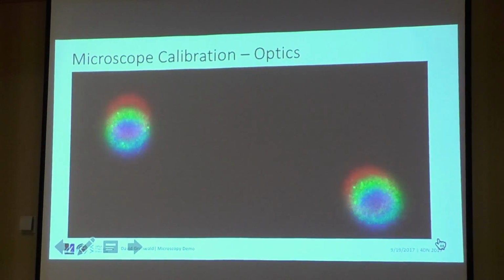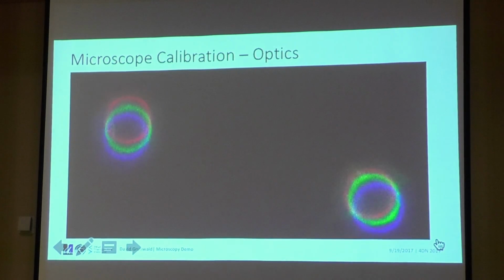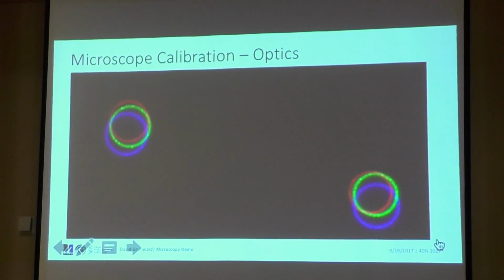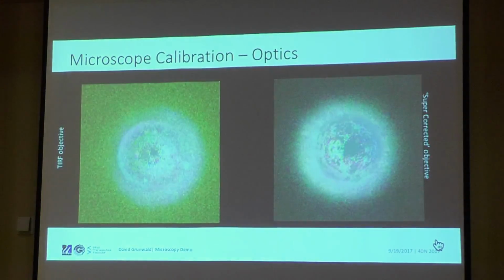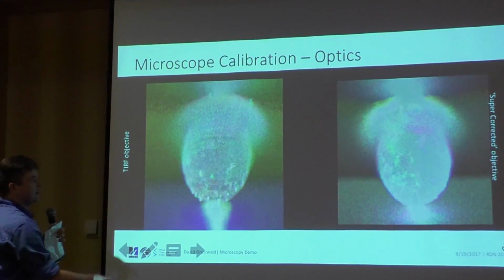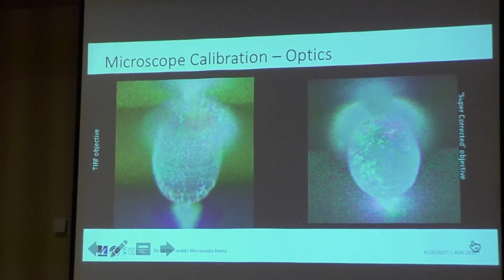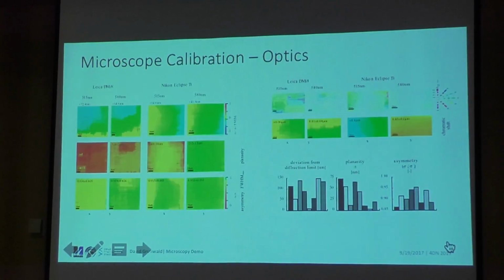They do very well. Yeah, these things are much heavier. They don't fall on the cover glass. They stay 10, 15, 20 micrometers deep into the immersion. And all of a sudden, things start looking very different. So this is a little comparison. This is a TIRF objective used to image a bead compared to something that is a little bit better corrected. And basically, the shapes are substantially different. The beads that you see, yeah.